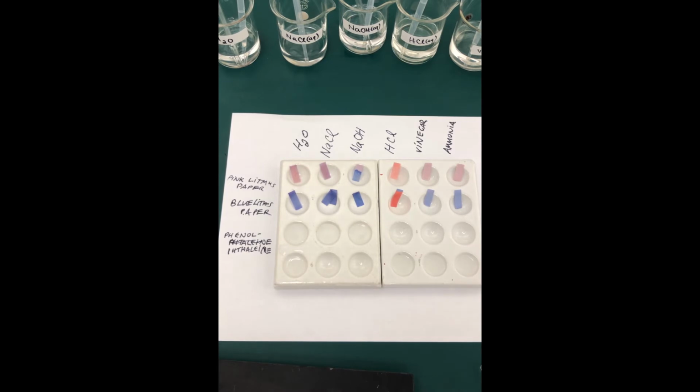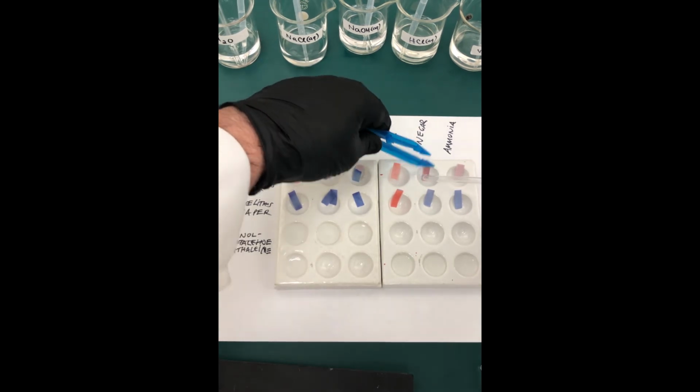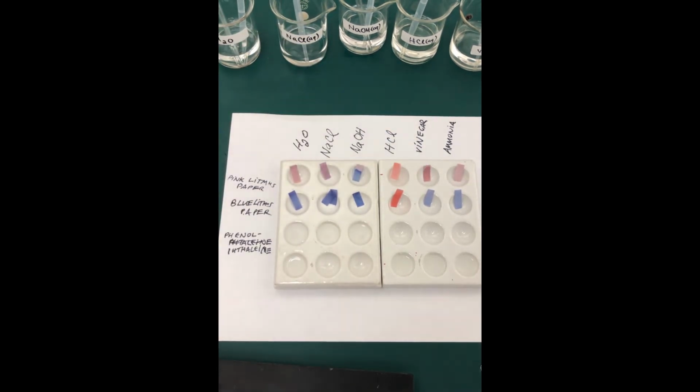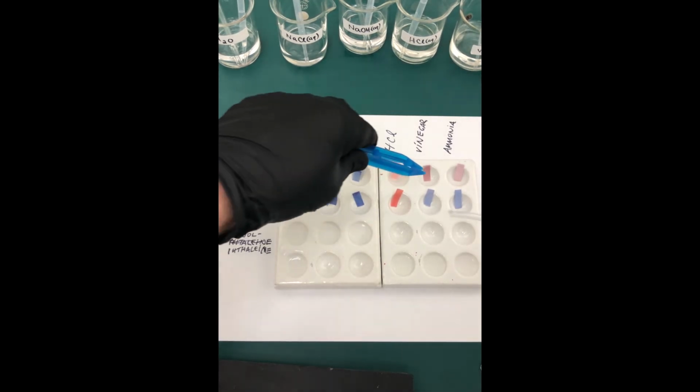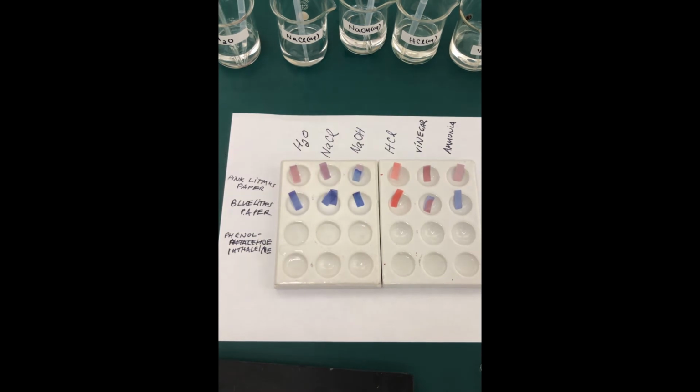Okay, let's try out now the vinegar. Remember, at this point, although you probably know, we don't really know what vinegar is, but most of you know what vinegar is anyway, chemically. Let's try it out against the pink litmus paper. As you can see, there is no significant change. Check it against the blue litmus paper. Oh, and we see a change to the color pink.